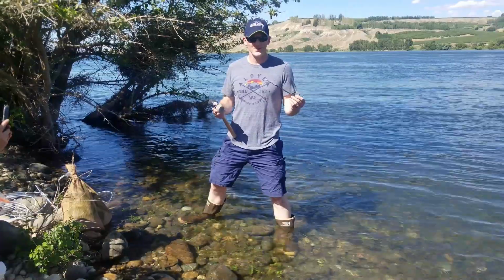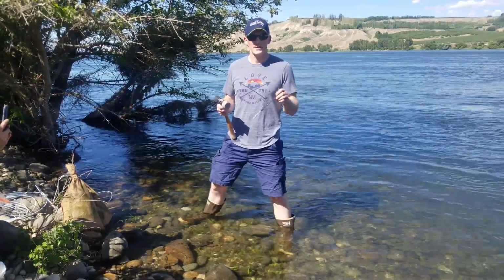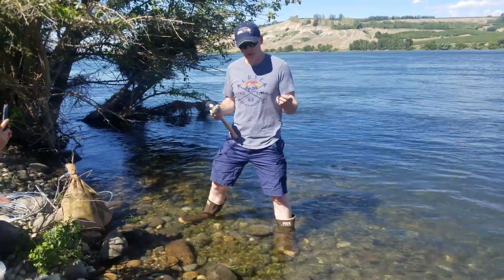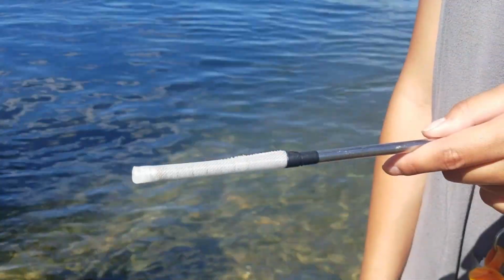All right, today we're going to go over the installation and sampling protocol for doing the time series sampling for WHONDRS. So you're going to get push point samplers like this. You can see there's a sock over the end.